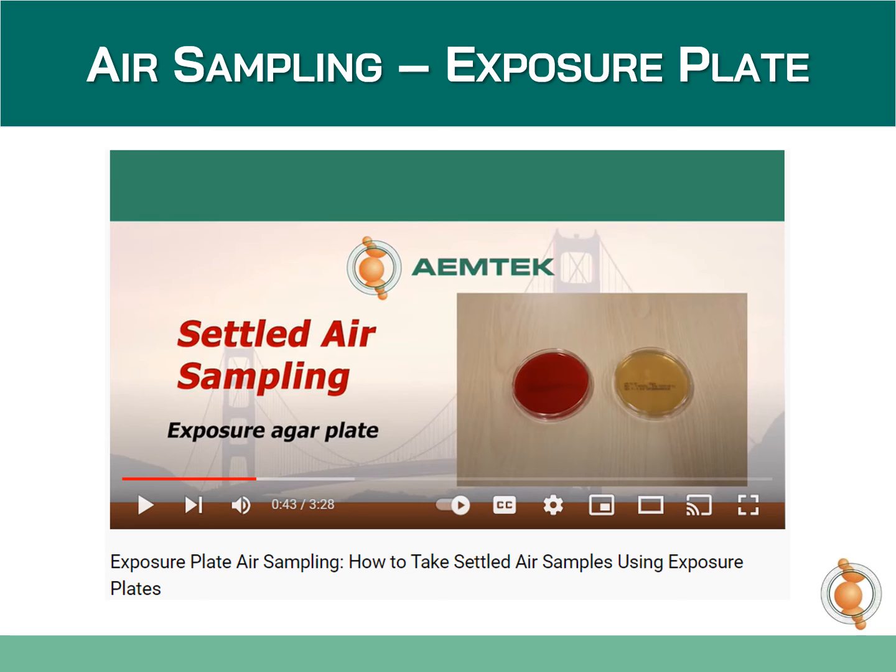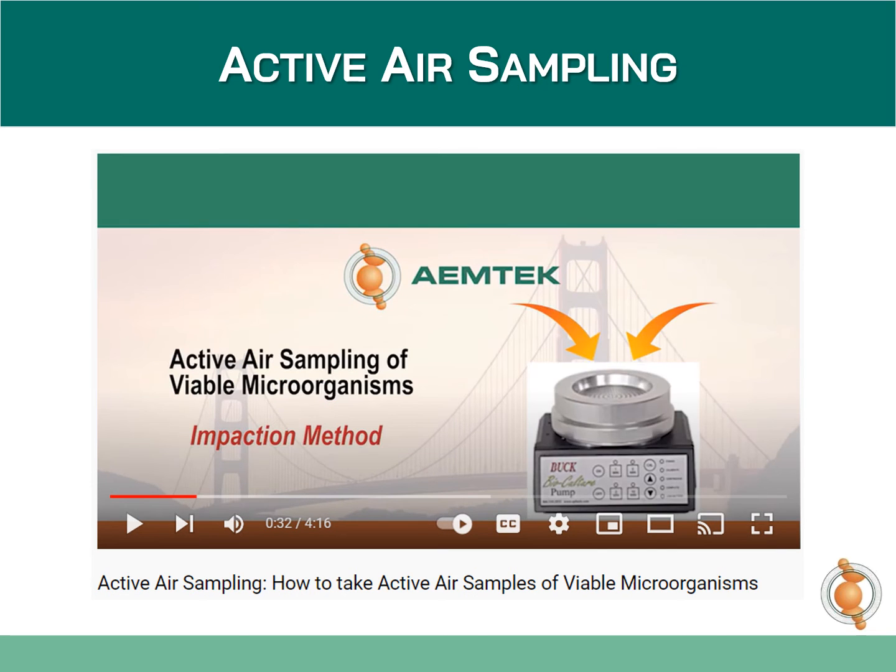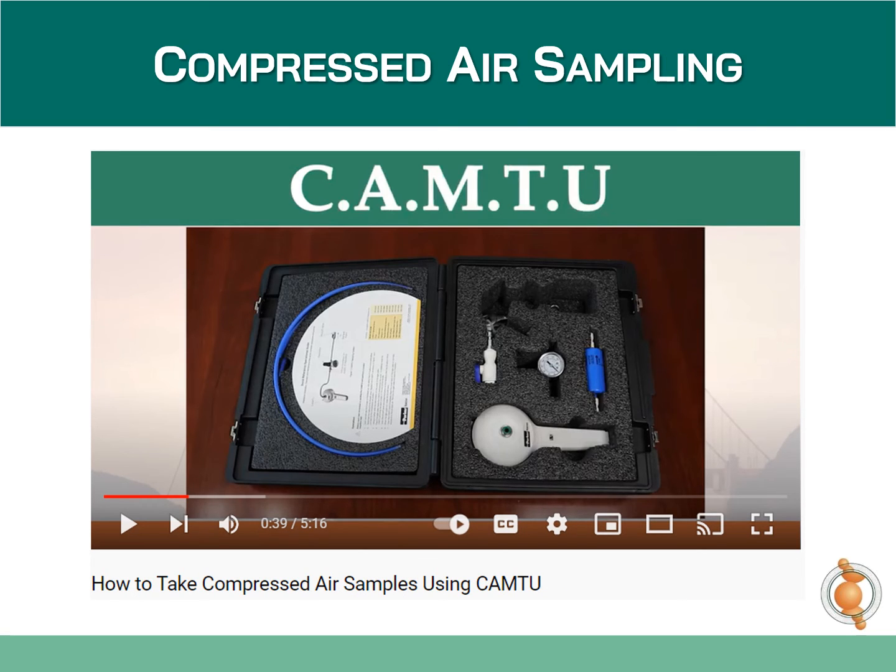Please visit the AEMTEK YouTube channel for instructions on how to take exposure plate samples. Please visit the AEMTEK YouTube channel for instructions on how to take active air samples. Please visit the AEMTEK YouTube channel for instructions on how to take compressed air samples.